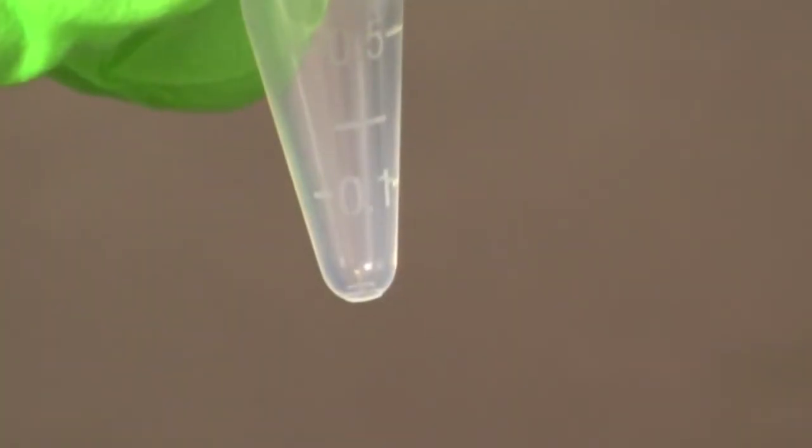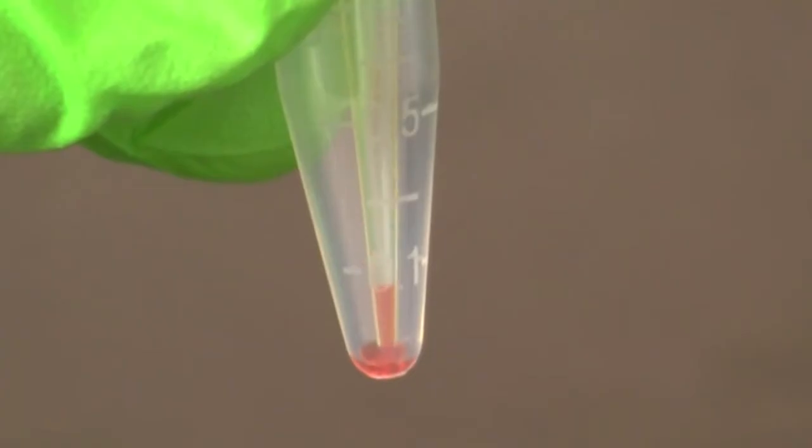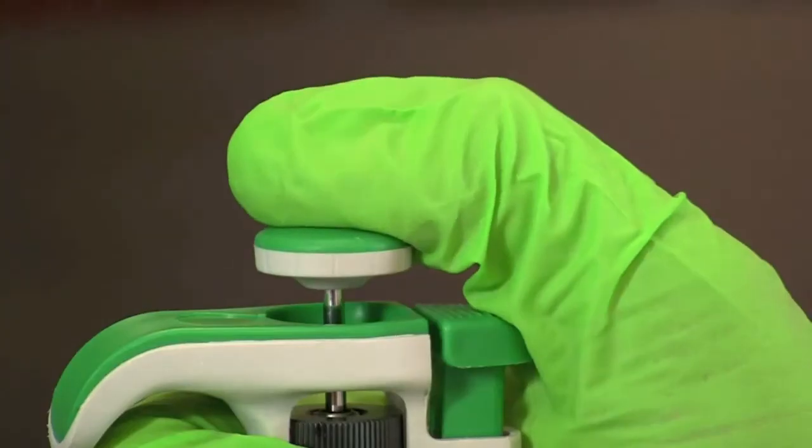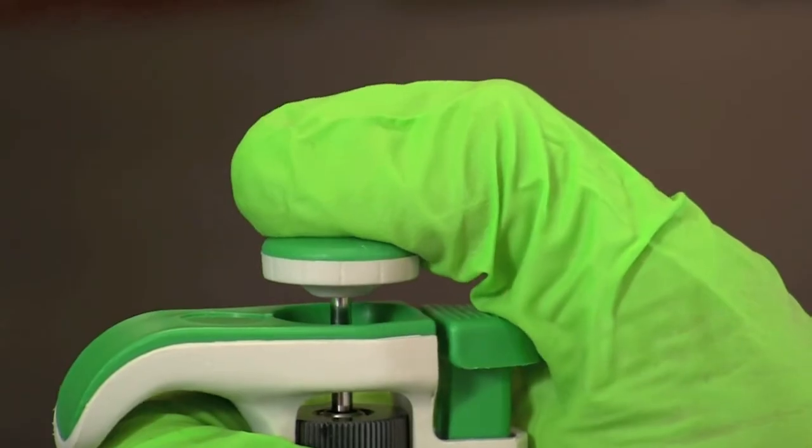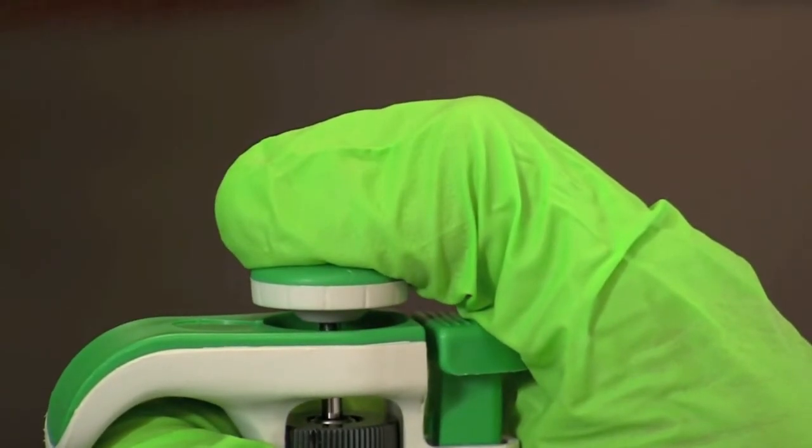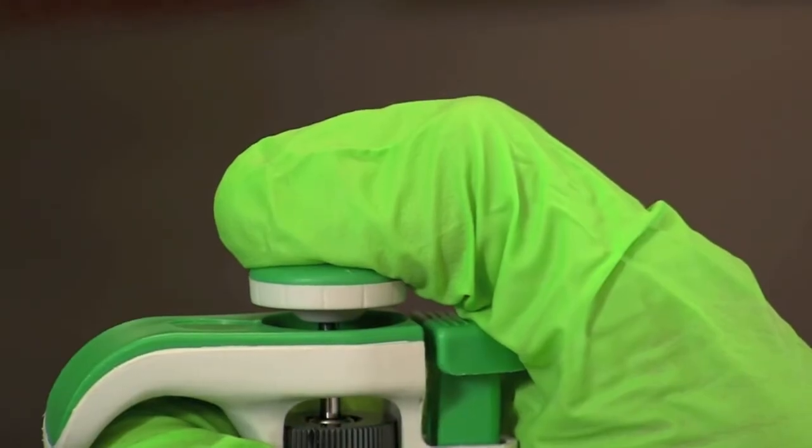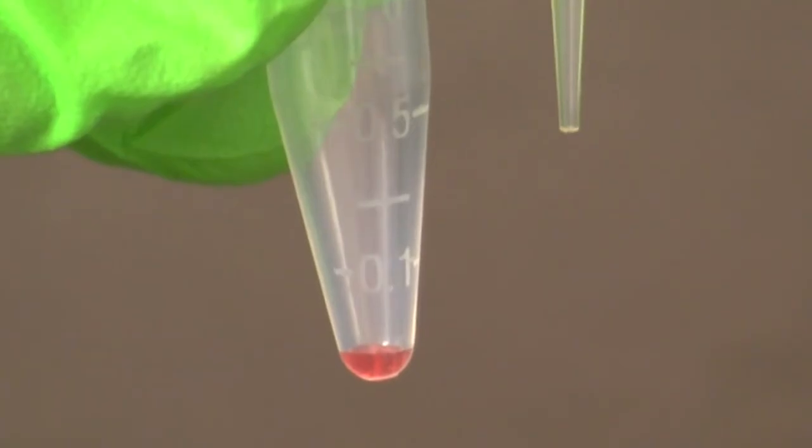To complete the transfer of a sample place the micropipette tip into a fresh microtube. Slowly depress the plunger button pausing at the first stop. Then continue depressing until the second stop. Now while holding the plunger button down remove the micropipette tip from the microtube. Once out of the microtube you can release the plunger button.